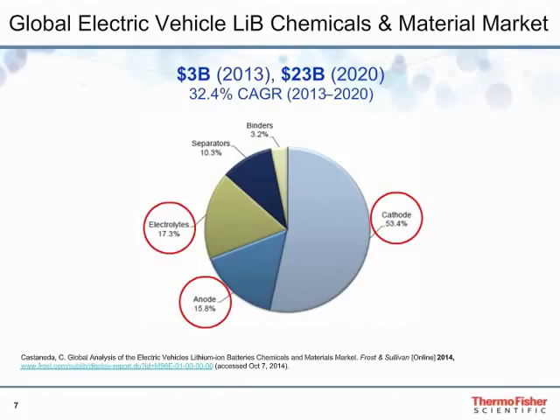As a result of this demand, there are reports of investments being made in R&D to improve battery performance, longevity, and safety. A particular strategy being employed is identifying degradation products and understanding battery degradation mechanisms. Understanding failure analysis requires analysis of the three battery components, individually and how they interact as a system. Today's presentation centers on degradation products resulting from the interaction between the electrolyte and the anode, which comprises nearly 33% of the chemicals and materials market.